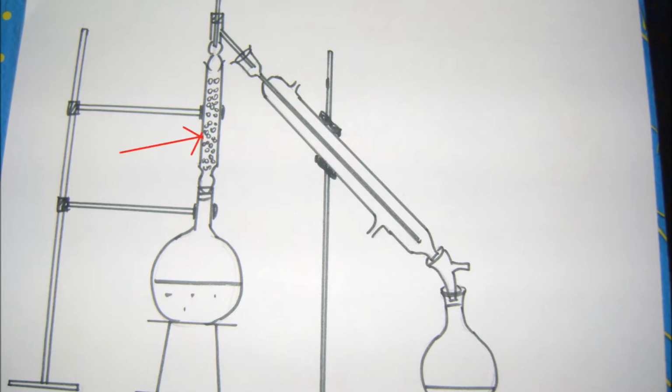This is the fractionating column containing maybe glass beads, and this will provide many surfaces which will allow heat exchange between the vapors. Due to loss of heat by the higher boiling component, it will liquefy, and hence only the vapors of A will remain in the fractionating column, which will pass through the condenser. Due to the low temperature of the condenser, the vapors of A will liquefy and form droplets which can be collected in a receiver flask shown in the picture.